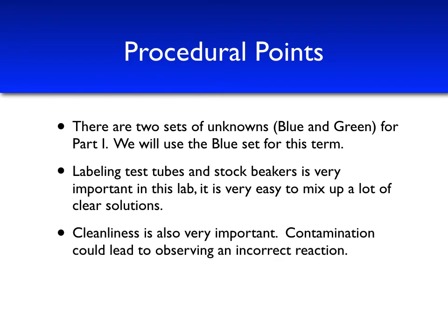Another important aspect is cleanliness. Contamination can lead to observing an incorrect reaction, which will allow you to make incorrect identifications when you draw your conclusions about either the components of an unknown mixture or the identity of your unknown solutions in part 1.